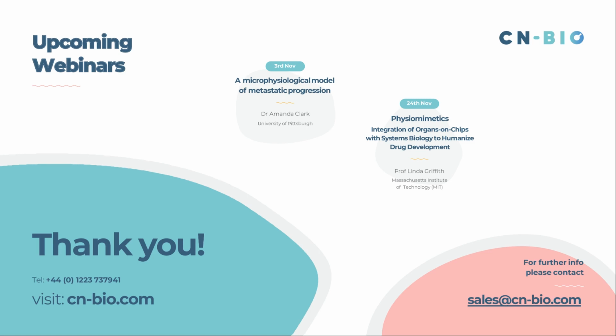But we have models whereby we can have, for example, mixed immune cells held within our platforms, in different compartments separate from the liver tissue or the gut tissue. So those immune cells can crosstalk and interact with the different tissue structures, allowing you to potentially answer some of these questions about immune-related tox. But the adaptive immune tox space is fairly challenging.